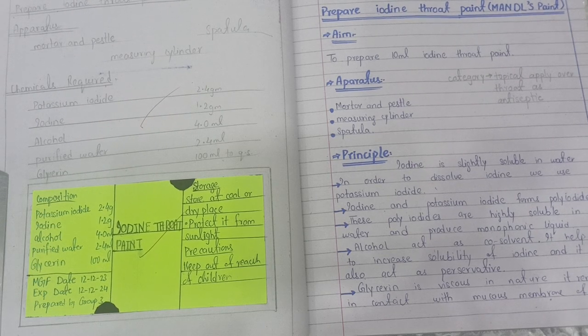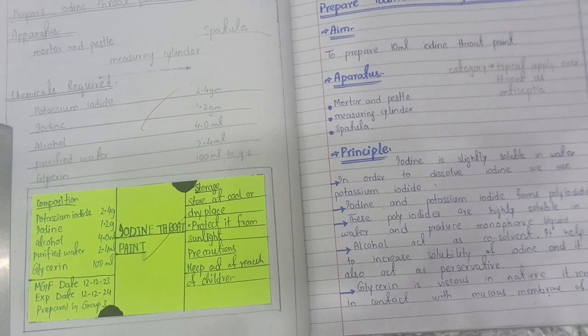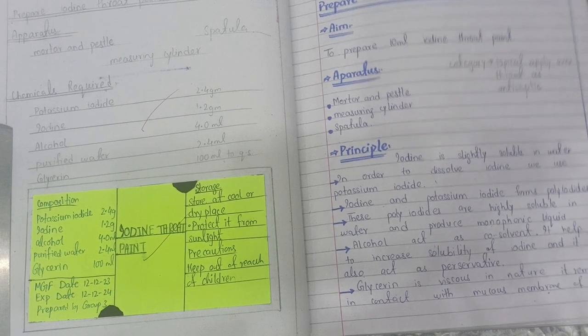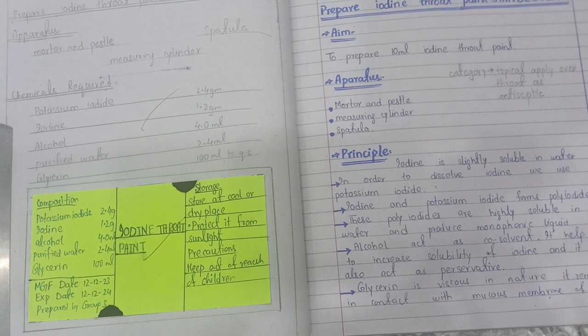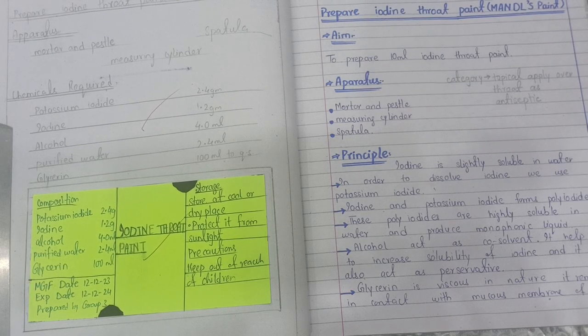It contains the glycerine and, so I am so sorry for that. I said that we add glycerine into the paracetamol syrup, but we don't add glycerine. We add what? Yes, you know very well. We add syrup, and about 70 ml of syrup we add in it. So can you remember the next experiment that we have discussed? Yes, it was about the terpene hydrate elixir.